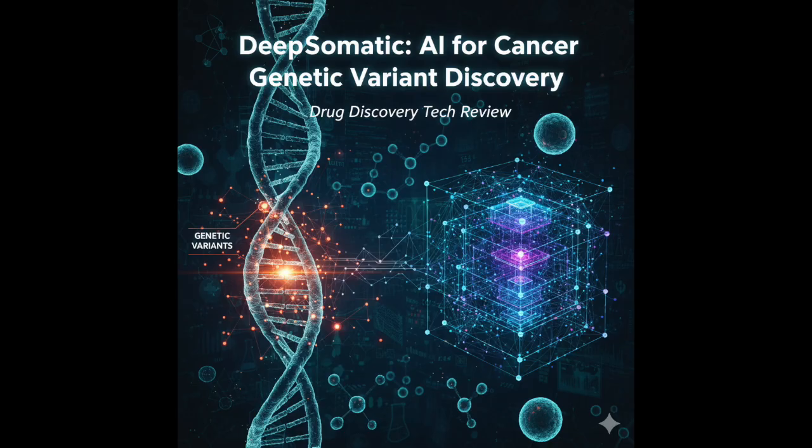They might work okay on HCC1395, but perform poorly on a different cancer type or data from a different sequencing machine. So the Google research team knew. They knew they couldn't just build a better algorithm. They had to build a better data set first. They had to solve the data problem before the modeling problem could even be properly tackled.